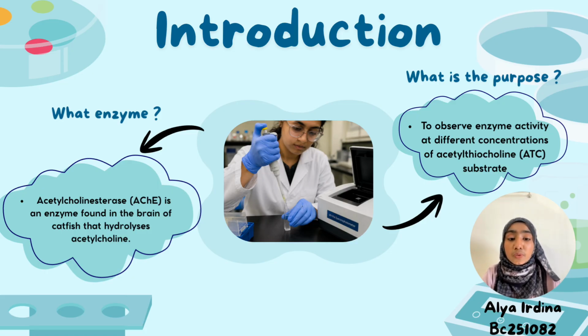The enzyme we are using in this enzyme assay is acetylcholinesterase, commonly called AChE. This AChE can be found in the catfish brain. The purpose of this enzyme assay is to observe the enzyme activity that happens at different concentrations of ATC in the lab session.